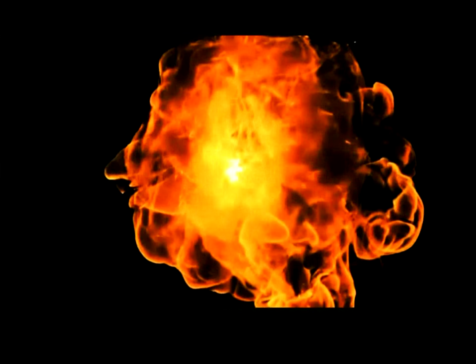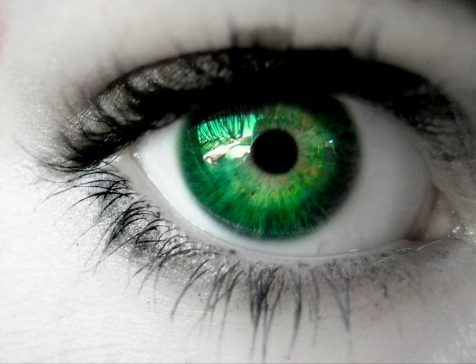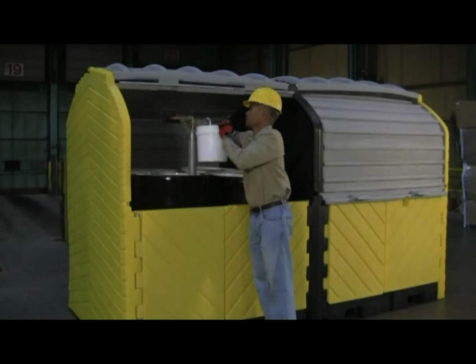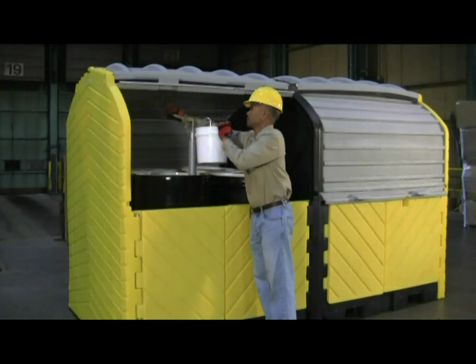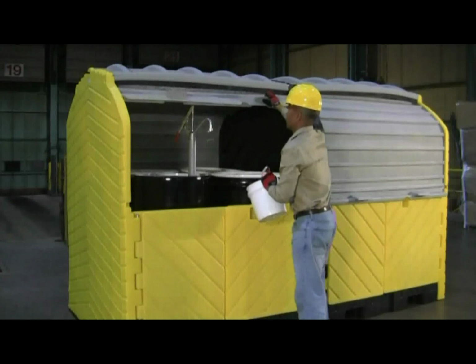See this symbol? This means that the material may burn or explode in the presence of flammable or combustible material, may cause fire when it touches combustible materials such as wood, may react violently or cause an explosion when it comes into contact with combustible materials such as fuels, may burn skin and eyes on contact. Therefore, you should keep the material away from incompatible materials and store in the areas designated by your immediate supervisor.